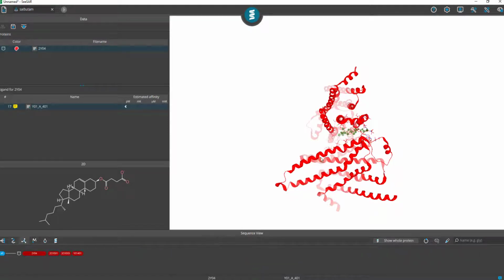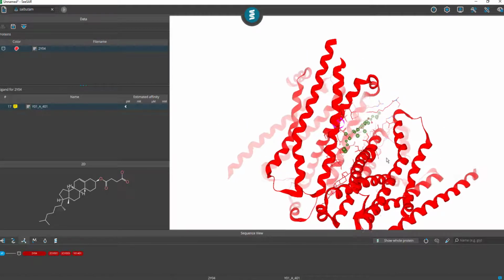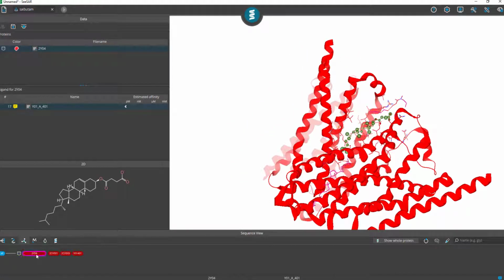So all of the other ligand molecules shown on the side here can be entirely switched off, or alternatively you could choose to switch one or two of them off, but for now let's switch everything off. Any metals, ions in your protein structure could be switched on or off, given that they were there in the first place.